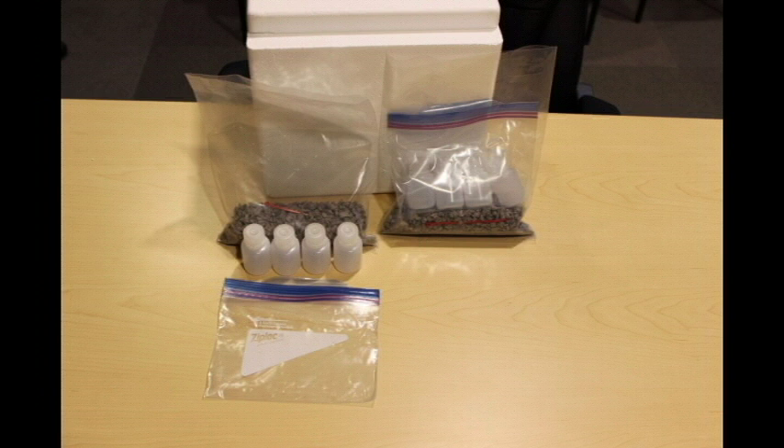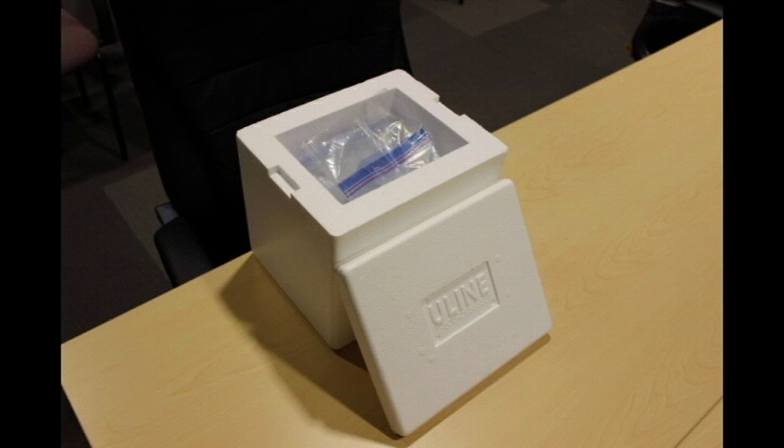Place these completed sealed bags into the styrofoam cooler with ice packs, whether they came with the kit or you have to get your own. Do not use water ice — you don't want anything leaking out of the package or the box to be wet for any reason. Put the lid on the styrofoam cooler and secure it with tape, preferably sealing the surface all the way around the top rather than putting an X of tape across it. Run the tape all the way around where the top meets the cooler.